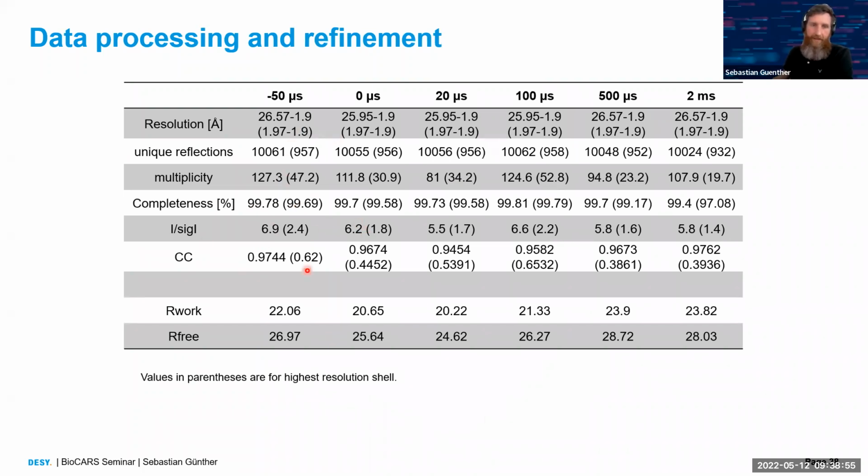So some statistics. The correlation coefficient could be better, but it's okay for the structure. So the structures refined reasonably well.